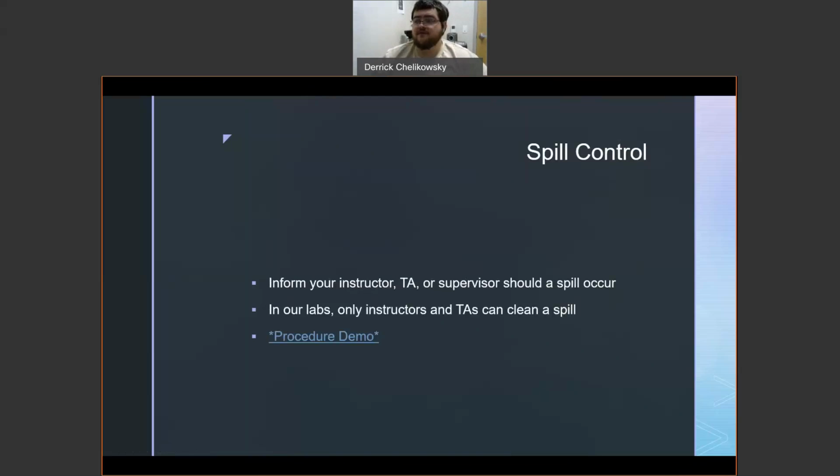If there is a spill, inform your instructor, TA, or supervisor if one of those were to happen. In our lab, only instructors, TAs, and myself can clean a spill, but we do provide a demo for you just in case you ever need to.